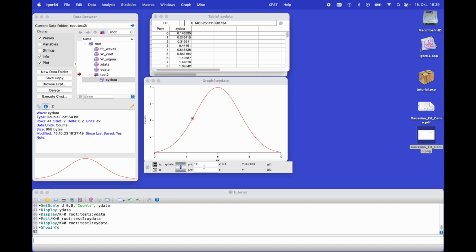At the bottom you will then see both the point number where the cursor is sitting and the X value. You can see it will automatically calculate the X value from the point number and show you the correct X value for each data point. And the variable to get the X value is just X.